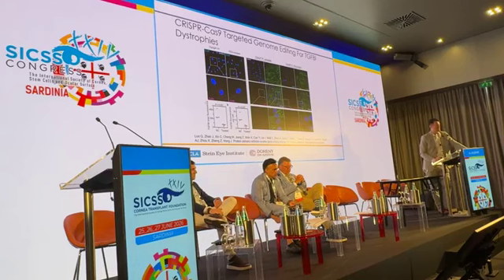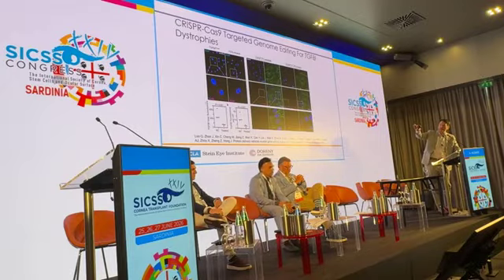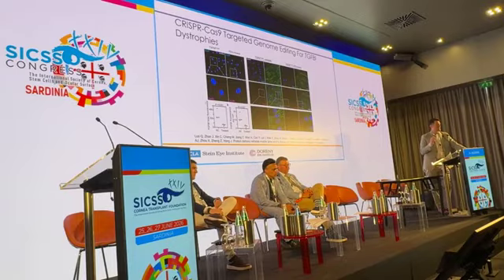On the left images, we're looking at a cell line from an individual. This is keratocytes from an individual with granular dystrophy type 2. The blue circles are the nuclei, and on the image on the left there, those little purple dots are the TGF-beta-I mRNA in the cells.